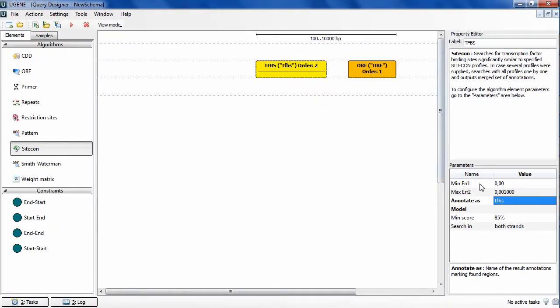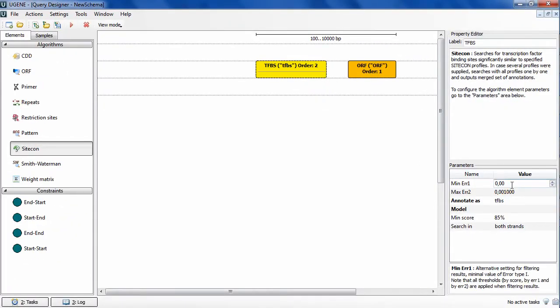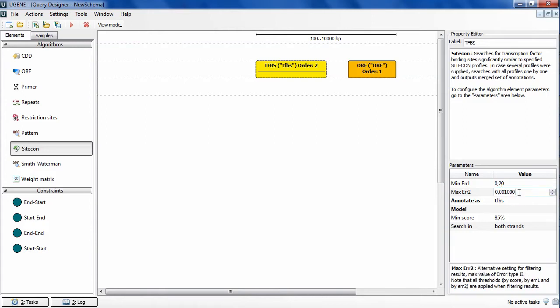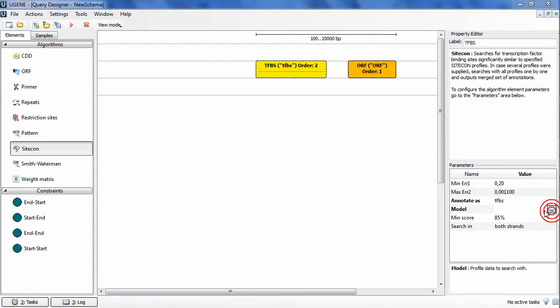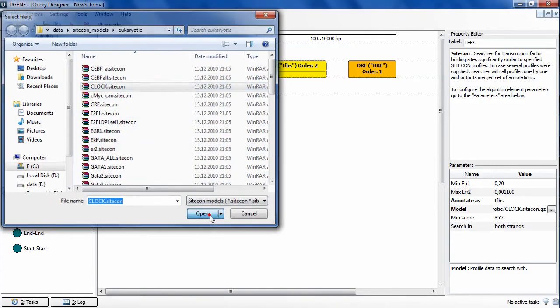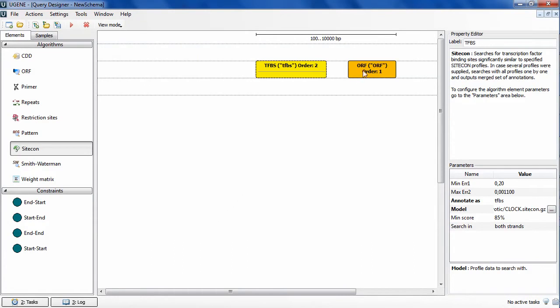Also I will specify appropriate algorithm's parameters and increase the ORF minimum length parameter value.